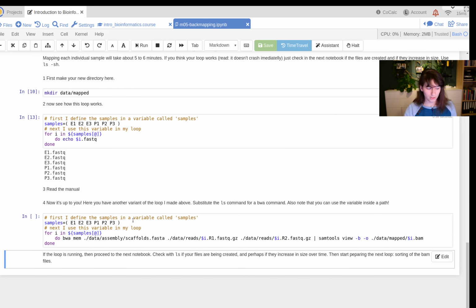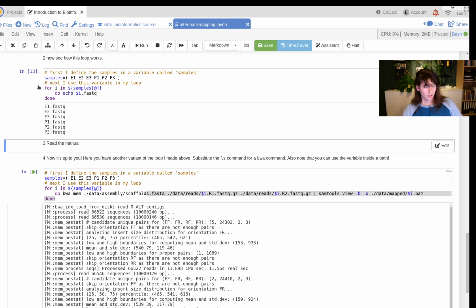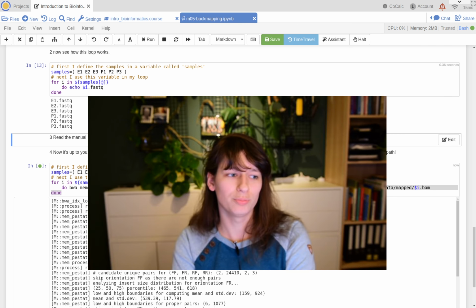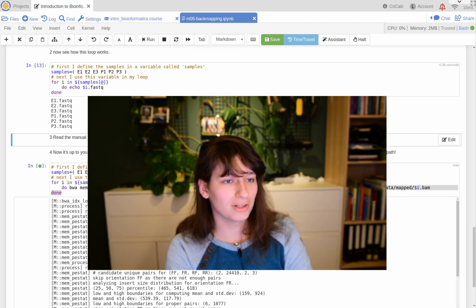This is a long video. Let's take a final second to think about what we're actually doing. So there's a whole technical challenge, but what's actually happening? Remember that these different samples we have, E1, E2, E3, P1, P2, P3, were originally one biological sample that went into a proverbial blender and DNA was extracted. In this sequencing process we then got two separate files, so I gave you 12 sequencing files originally taken from 6 samples.